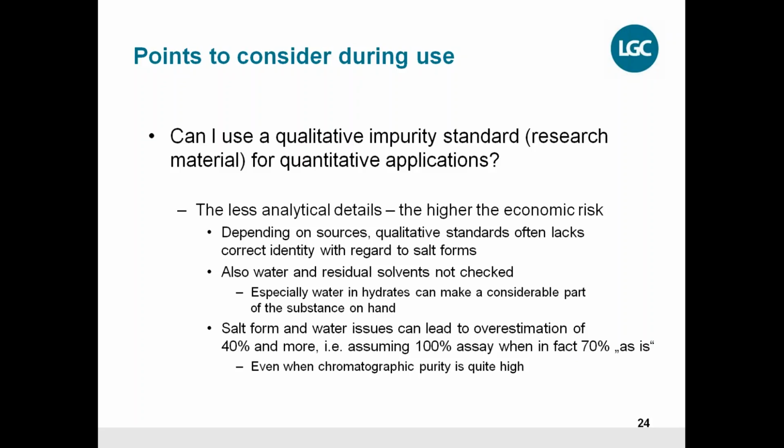And that can even happen when the chromatographic purity is shown on the certificate as quite high. This can easily happen if you have a combination of the salt form and the water issue. And the water issue, you never know, because on a qualitative material it is not very often tested. So that is what I wanted to share with you here as well.